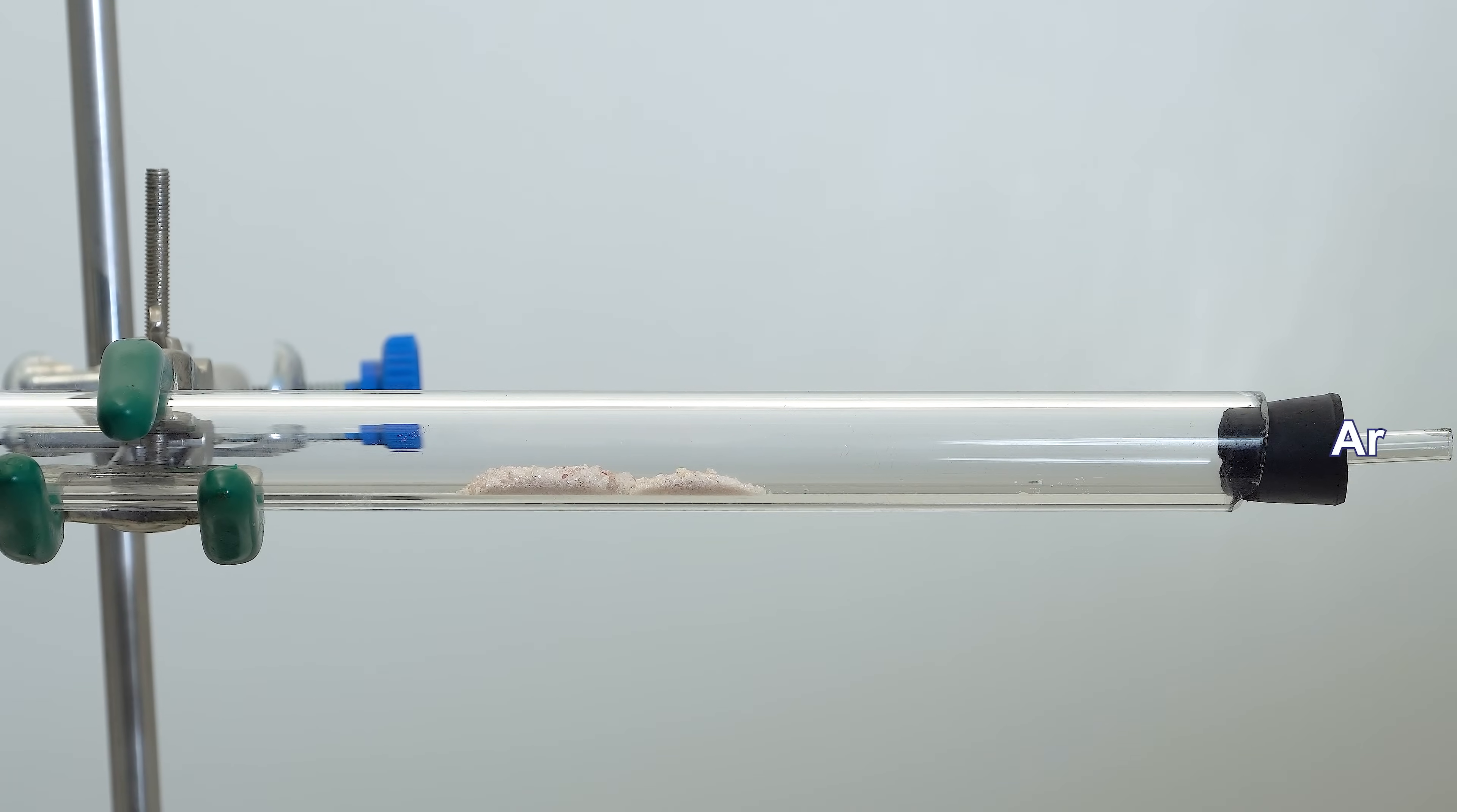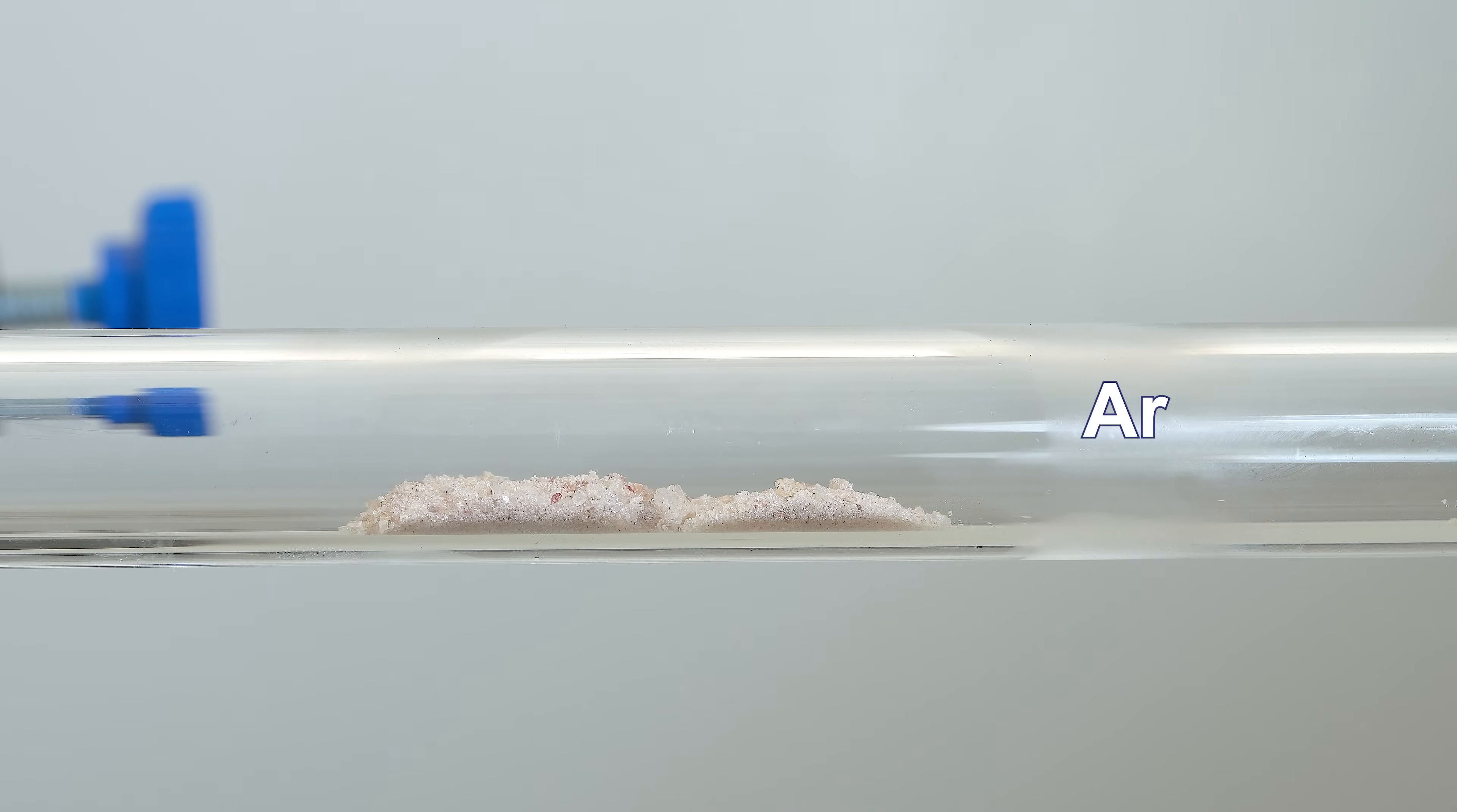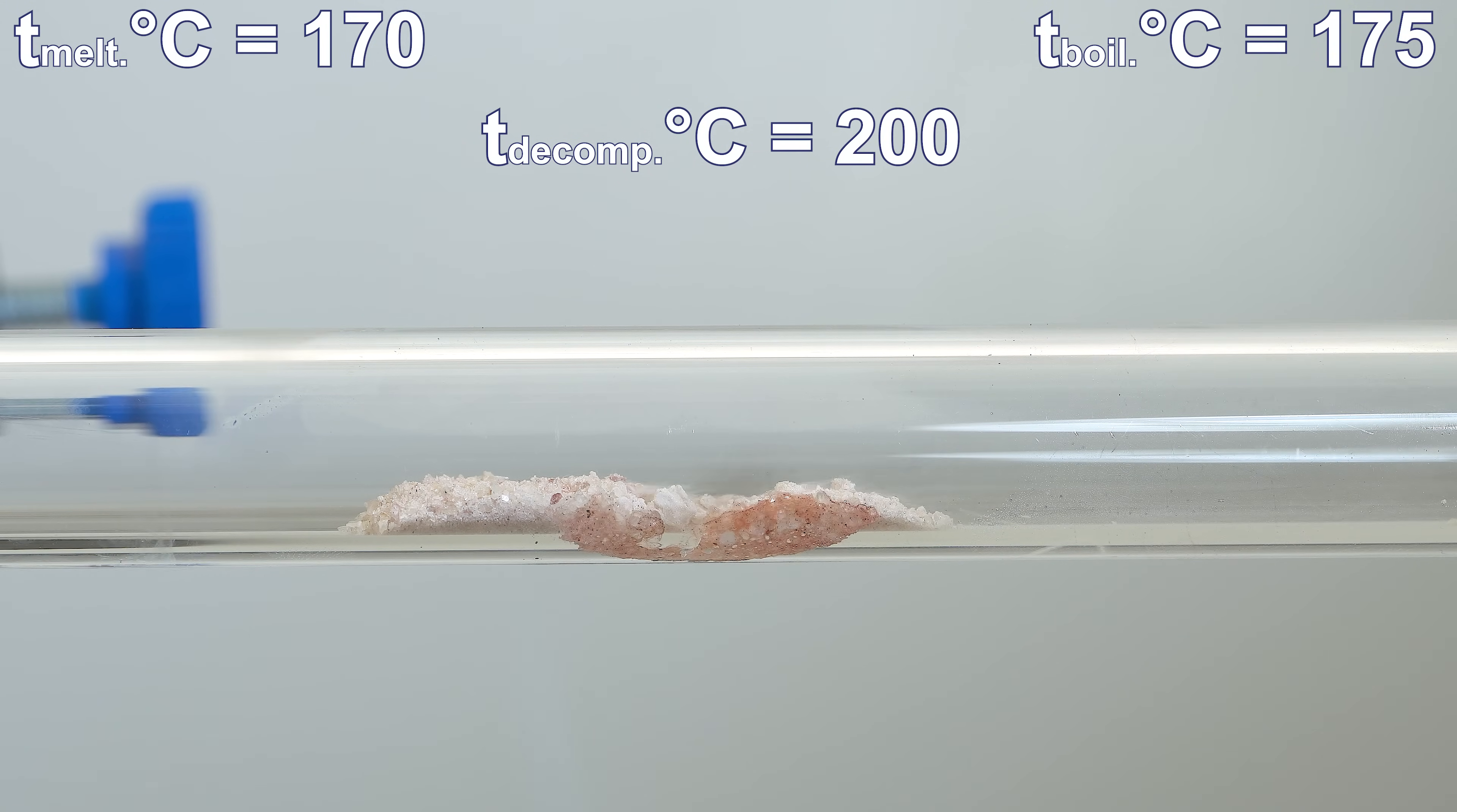Now I'll start passing an argon flow through the tube while applying heat to the tungsten hexacarbonyl using a gas burner flame. The melting, boiling and decomposition temperatures of tungsten hexacarbonyl are very close, allowing us to witness all three processes concurrently.